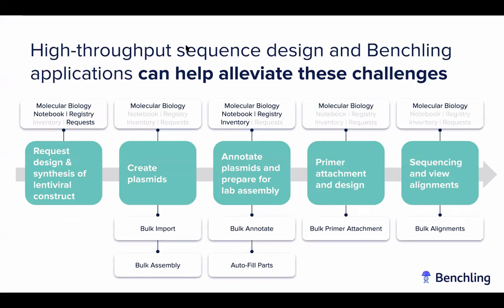So what we're going to demonstrate is going across this entire workflow, how can you do this in Benchling, and how can you use our bulk and high throughput tools to achieve this end to end? So I'm going to transition this to Damien now, who's going to walk through how you can do this workflow in Benchling. Okay, thank you very much, Ashoka. So I'm now just going to jump into the Benchling platform to begin our demonstration.